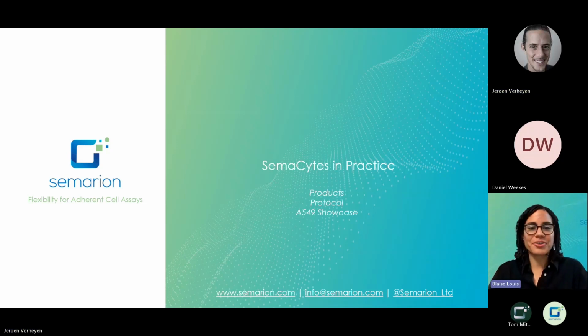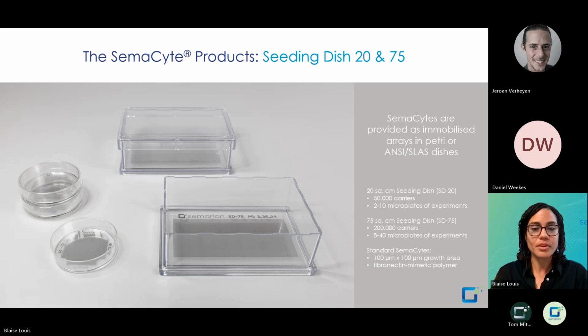Thanks, Jerome. Hi, good morning, everyone. Today I'll be introducing you to the SemaCyte products that we have developed. I'll be going through the general protocol for using them and highlighting some of the benchmarking experiments that we've carried out using A549 pulmonary adenocarcinoma cells.